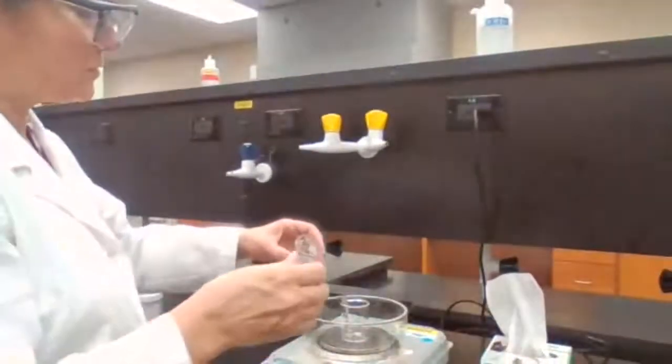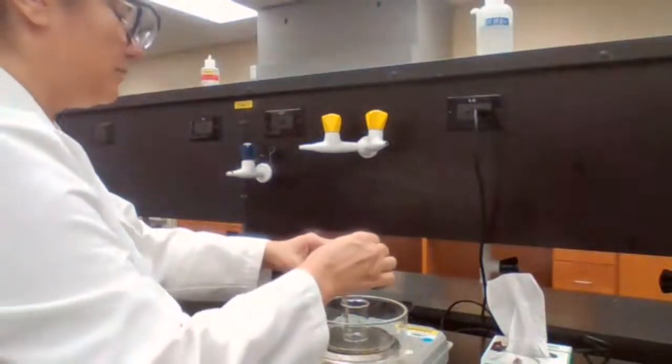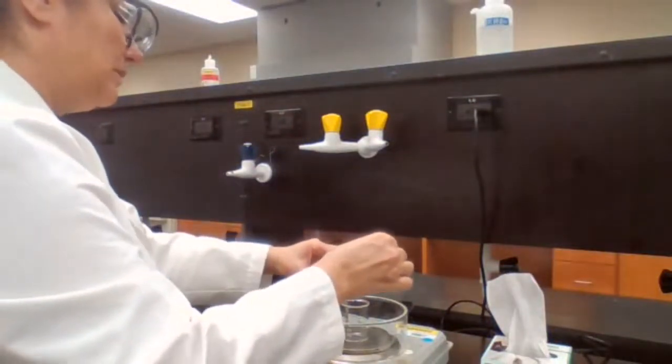Now I'm going to transfer the liquid portion only into the beaker.